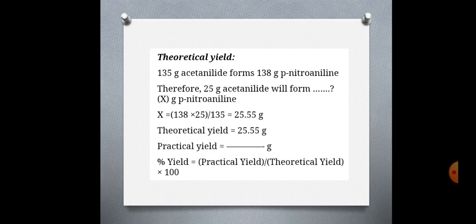For the practical yield, we have to perform the practical and weigh the product appropriately. Percentage yield is equal to practical yield upon theoretical yield into 100. That's how we can find the yield which we obtain by the practical.